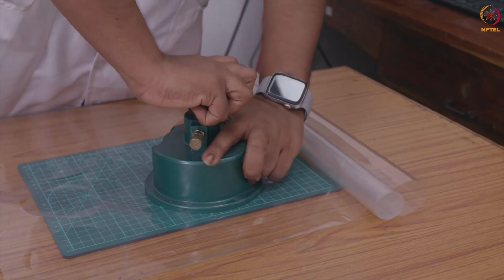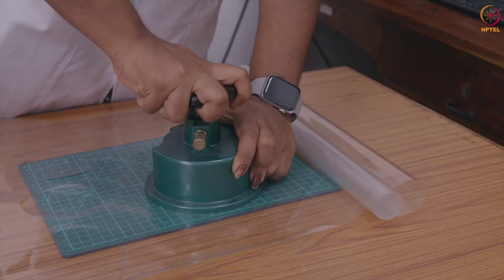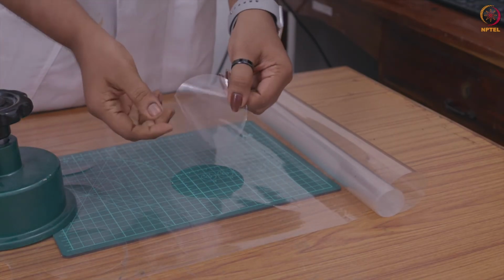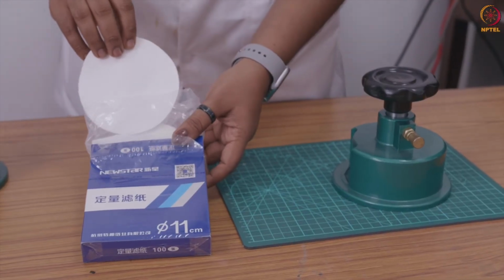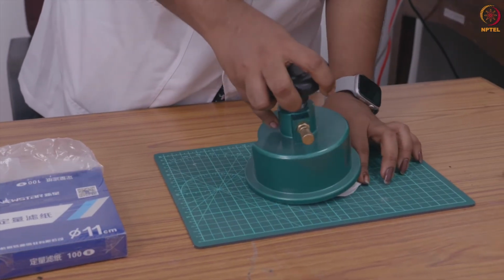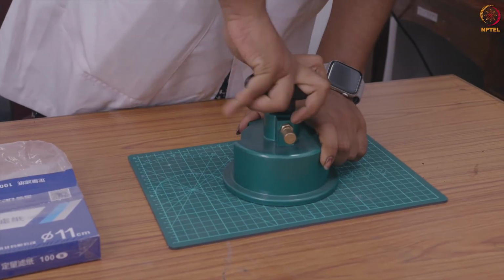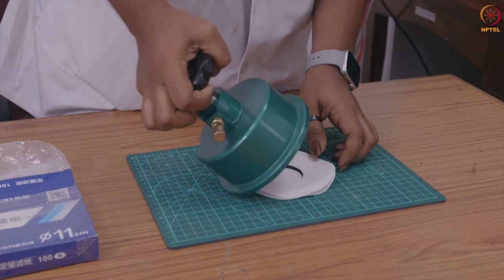Next, we'll be doing the oxygen transmission rate. In this software-assisted apparatus, oxygen transmission rate is measured on the basis of the differential pressure method. The test sample is first conditioned and cut. Filter paper is also kept along with the sample so that any moisture that may be present in the test gas may be absorbed by the filter paper, thus preventing entry of moisture into the chamber.